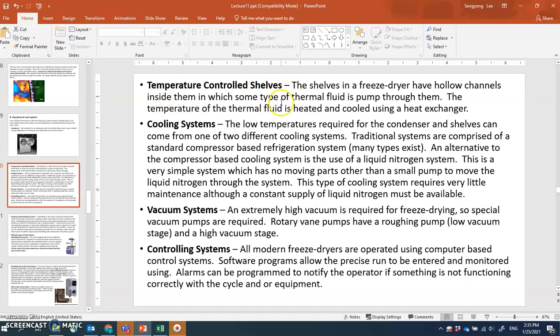So through the transmit of the temperature, your drug will also be frozen. Okay, and the cooling unit, this will freeze down. So there should be an efficient cooling unit that will change the temperature of your shelf. Okay, so you'll need to have that. Cooling or heating will take place at the same time.